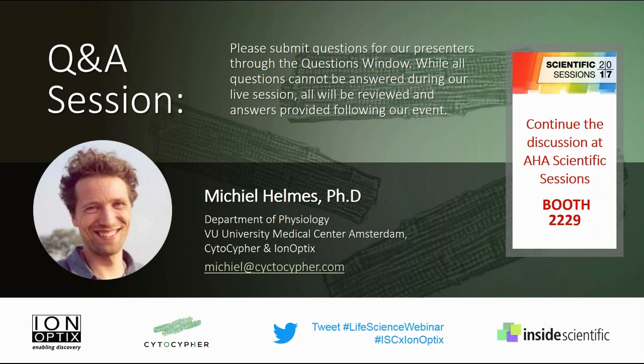We haven't been thinking about it, and I'm not excluding that it will happen in the future, because it's actually not all that difficult. But we started the company in September 2015. We have just shipped our first system. So what we did is we made the absolutely minimal viable product that gave us really good results, and we decided to worry about the peripherals after that, which we're addressing right now. But the system does include a field stimulator. Yes, correct. It's just not built into the microscope.